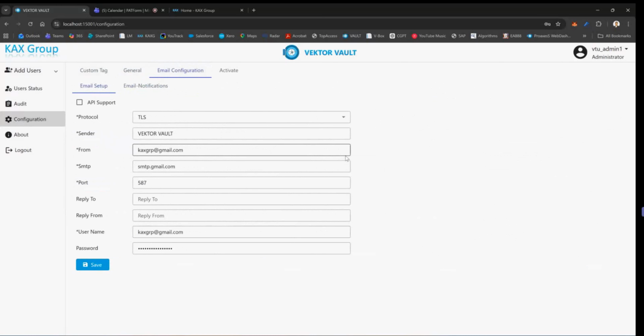So you can set up so that each time something happens, so if a developer's made a model and uploaded it for approval, then the approver will get a notification in email saying, hey, so and so sent this, go and approve it. Once they approve it, the developer can get an email notification saying it's approved or rejected so that they can then go and do something with that.